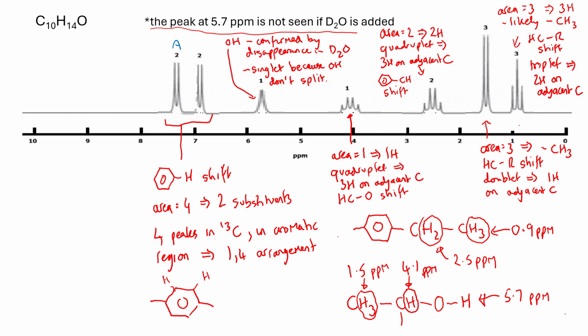So A, B, C, D, E, F, G. And then instead of having all these annotations around the spectrum, you could just talk about, peaks A and B have the aromatic shift, and so on. Peak C disappears in D2O. And that's quite a neat way of writing the same information down without having to fit it all in with lots of arrows around the spectrum and so on.